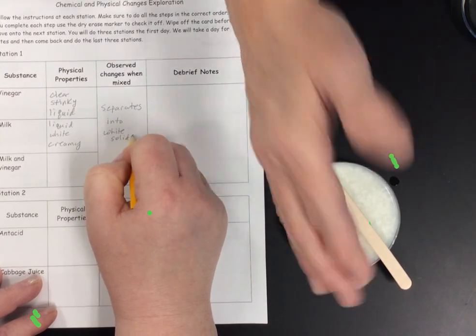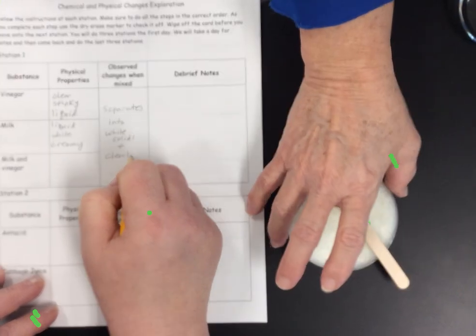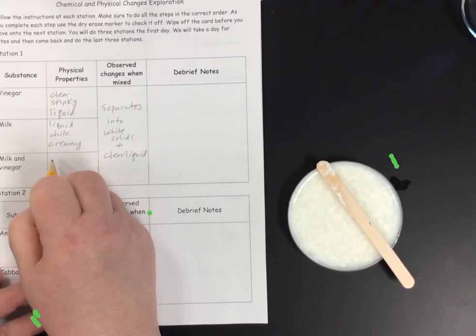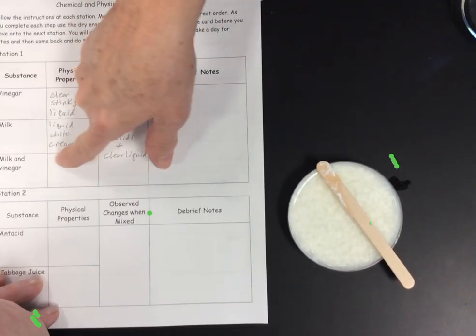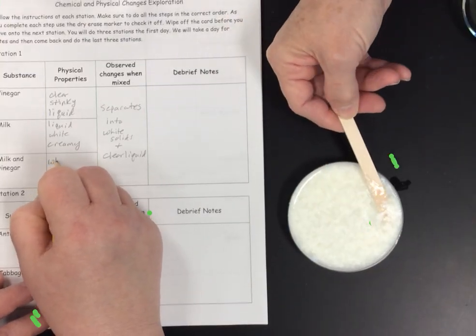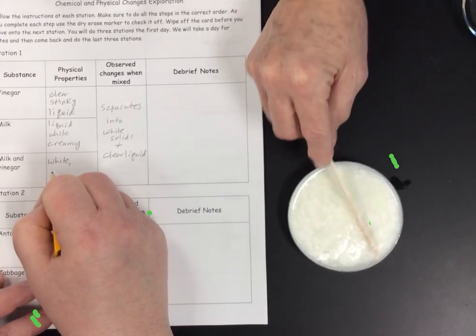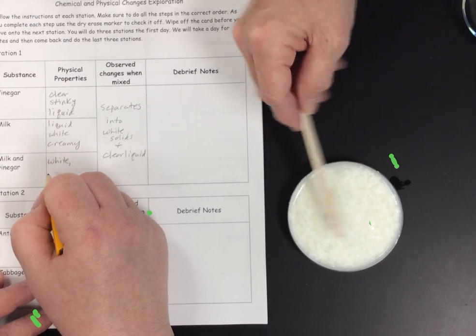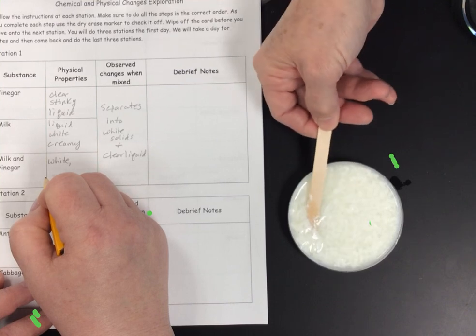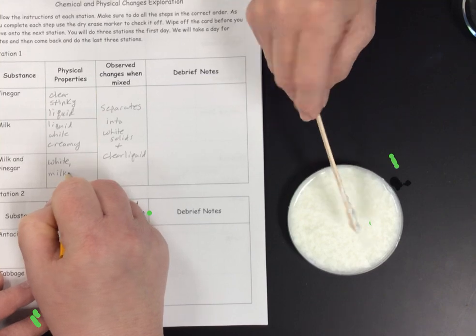I don't know if you want to smell it. Still stinky. All right, so that's for the milk and the vinegar for the physical properties. It's still white. It still has some clear or milky looking liquid. Well, it's not milk though. It doesn't look like milk. It's a little bit milky liquid, but not like the milk before.